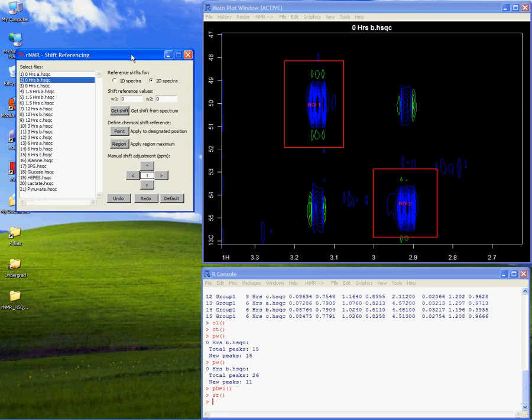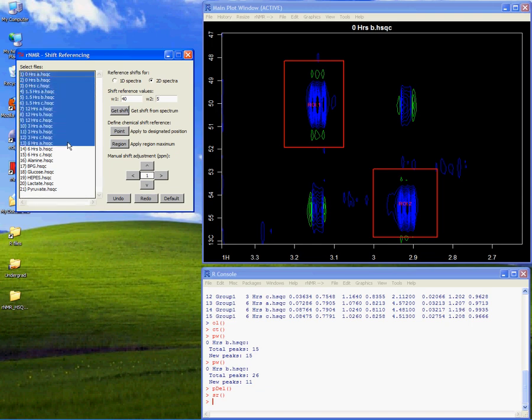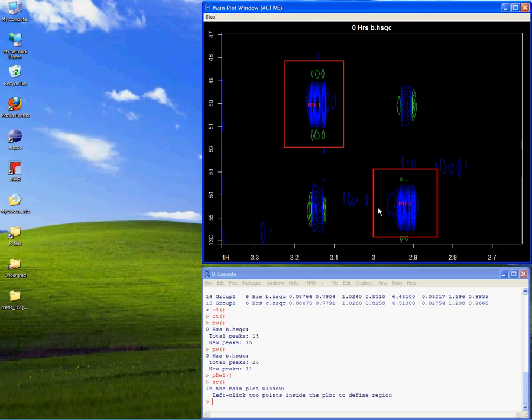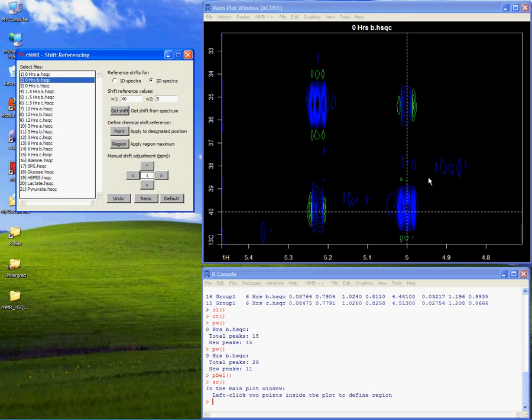First, I'll set the new chemical shift values for the reference peak. Most RNMR GUIs, like this one, contain a list of open spectra on the left, with options and functions on the right. So I'll just select the spectra I would like to reference, and then I'll click the region button to reference the peak. RNMR will use the maximum intensity from a designated region as the reference point, and will automatically adjust the chemical shifts for the selected spectra using the values provided.